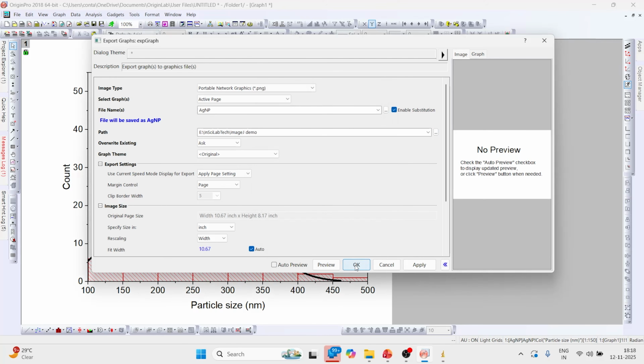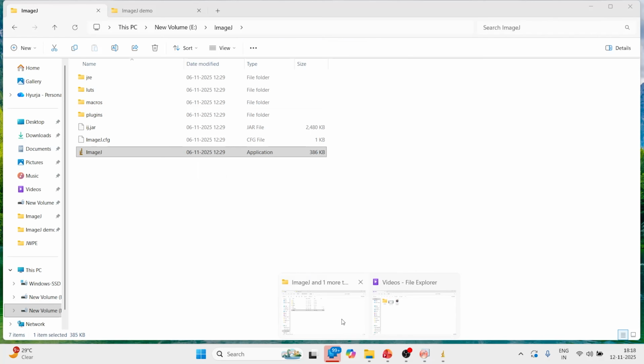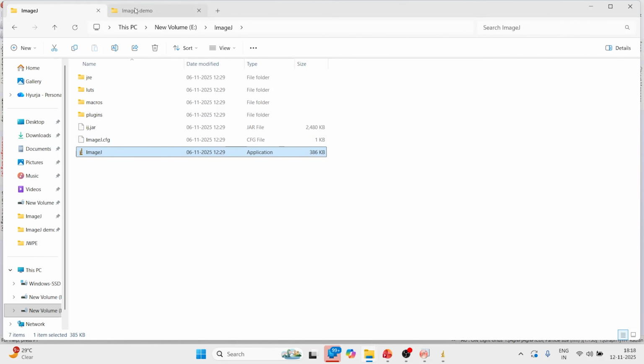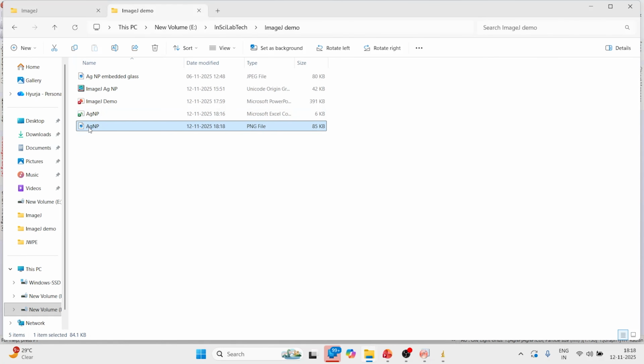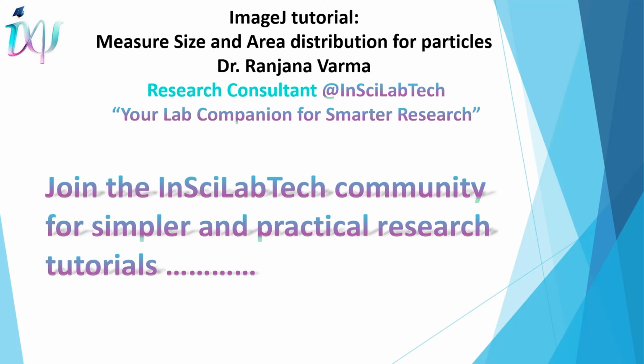Okay. So your image is saved. Now you can use this image in your thesis, research paper or presentation.